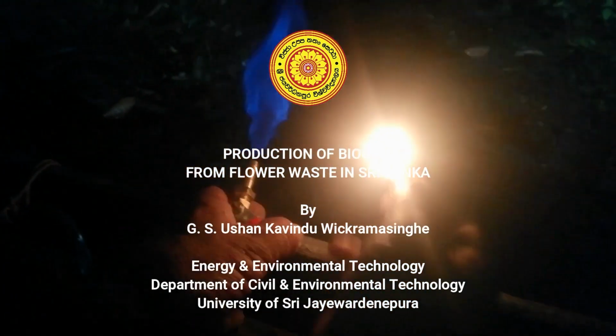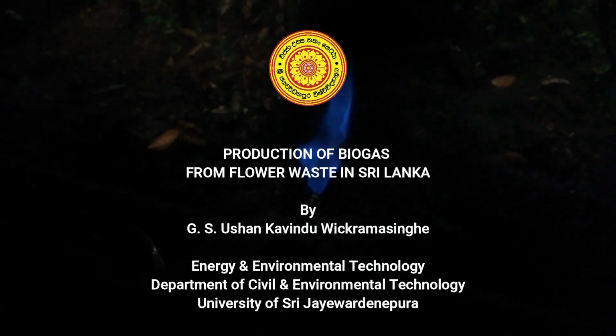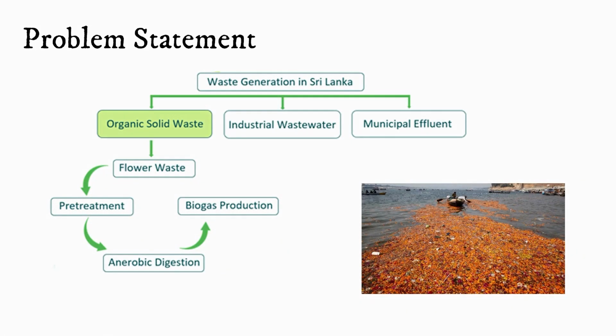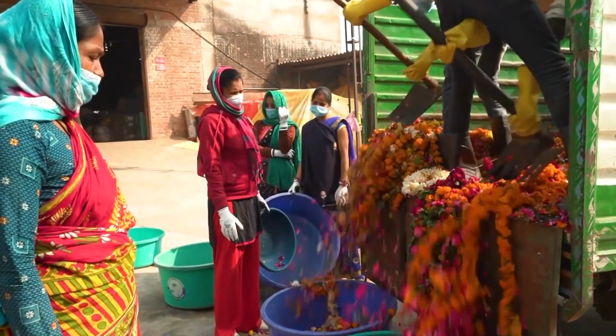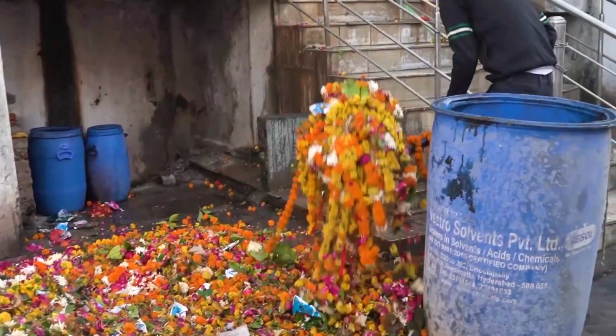In this video we will walk you through a simple explanation about the problem statement, how to set up a laboratory scale biogas unit, and its functionality. This research focuses on assessing the feasibility and optimization of biogas production from flower waste in Sri Lanka. So, let's get started and dive into the details.